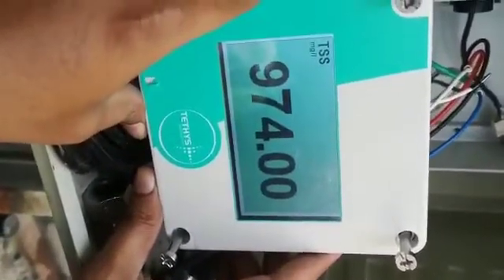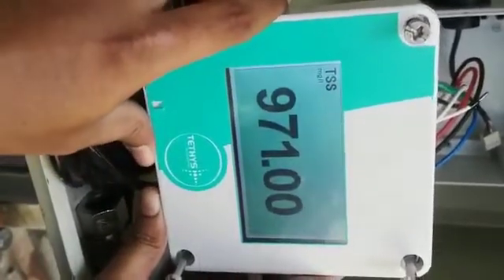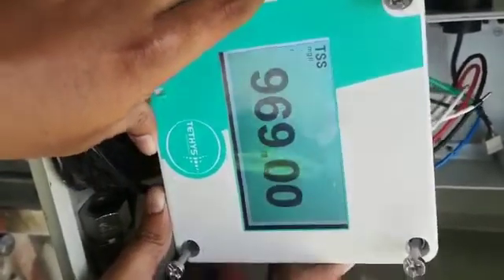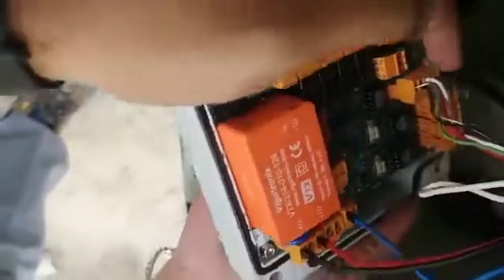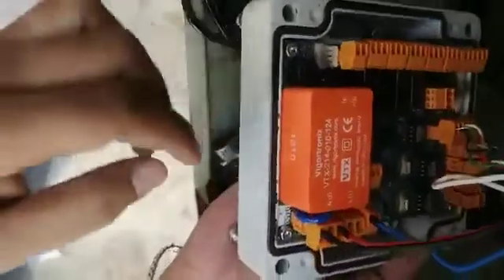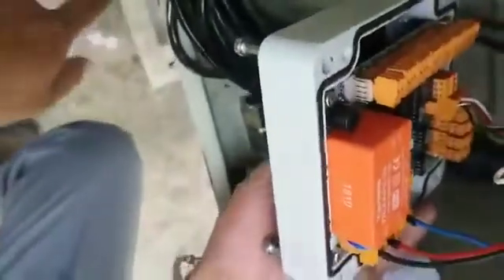This is the Tethes PSS Analyzer. We have connected the probe connections to RS485. This one is the 4-20mA output for PLC. This is the power connection, and the sensor is connected here.